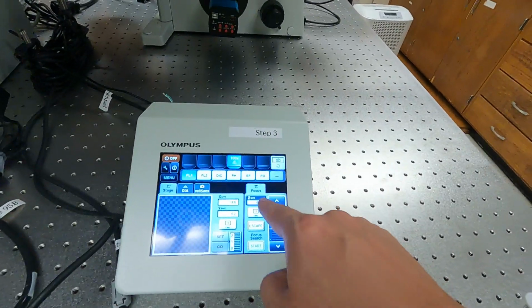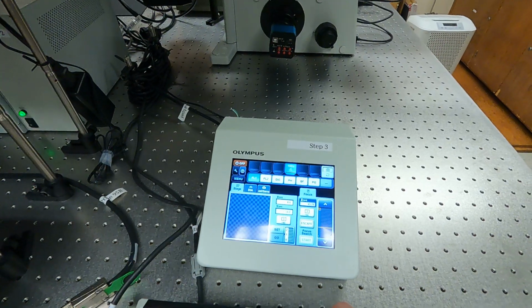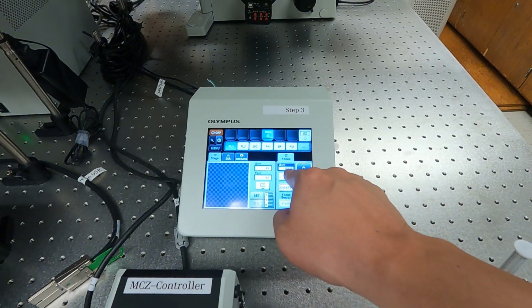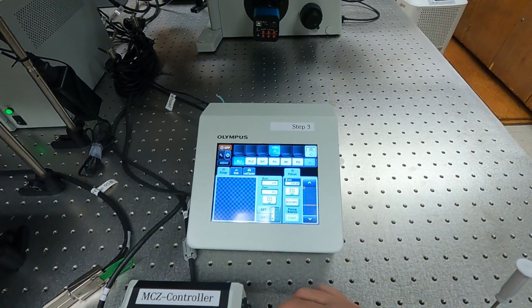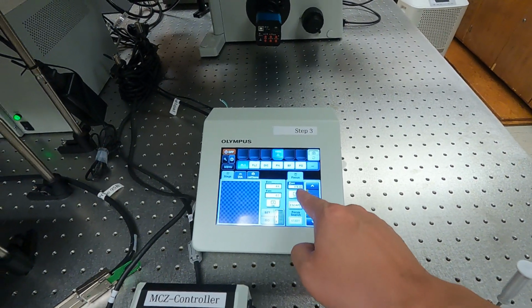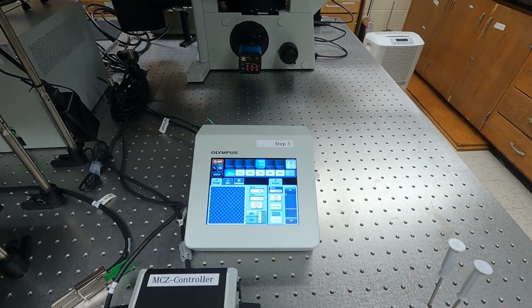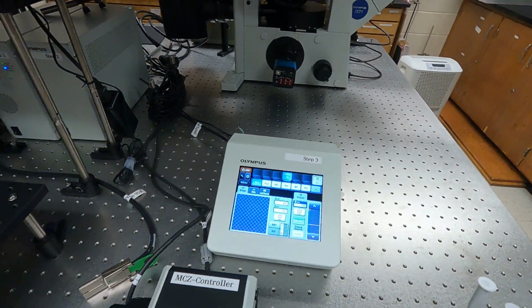The Z direction is actually indicated on this console here. As I adjust the focus, you can see the Z number is constantly changing. Right now I'm bringing up the objective, moving it up, so this number keeps increasing. If I press this escape button once, all of a sudden this Z value will go to 0.